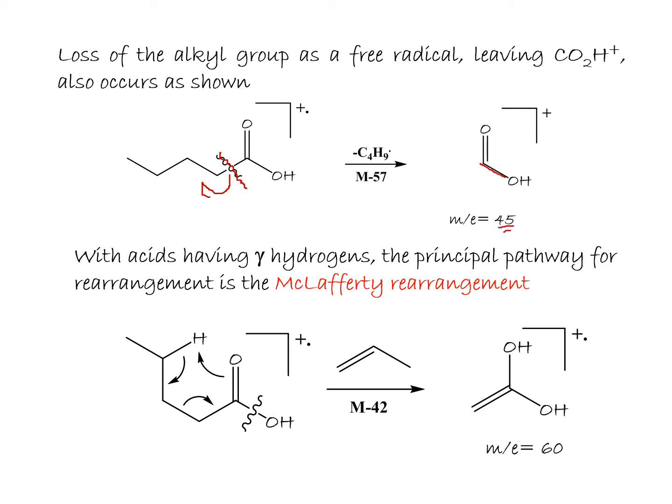With acids having a gamma hydrogen, the principal pathway for rearrangement is the McLafferty rearrangement.